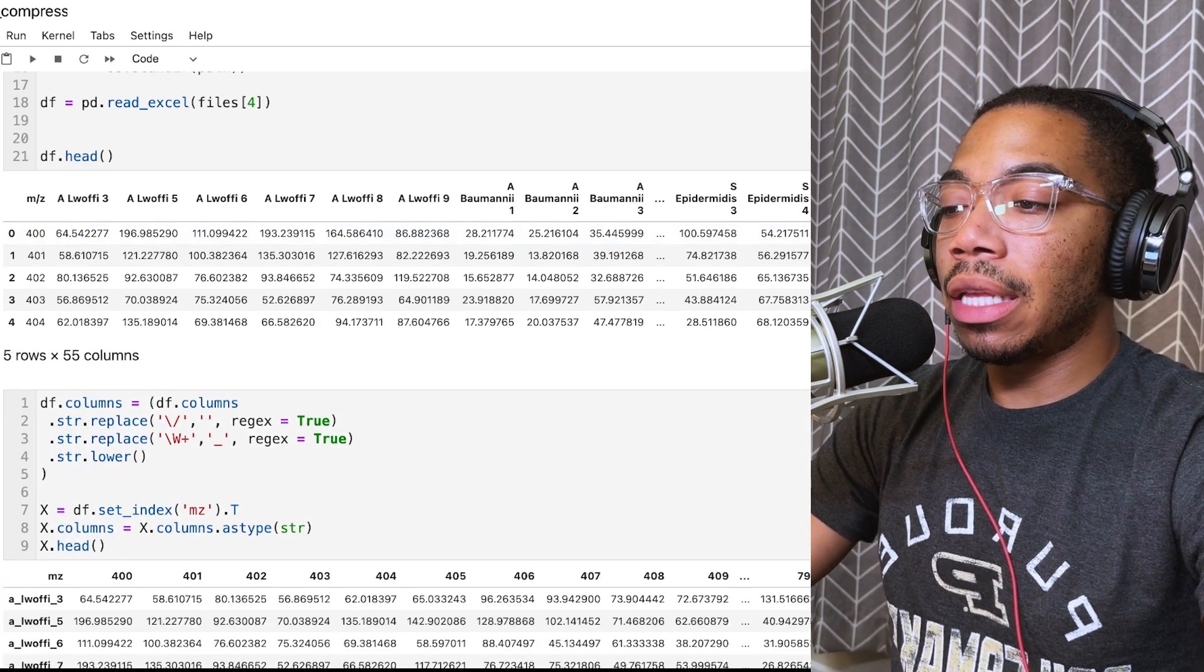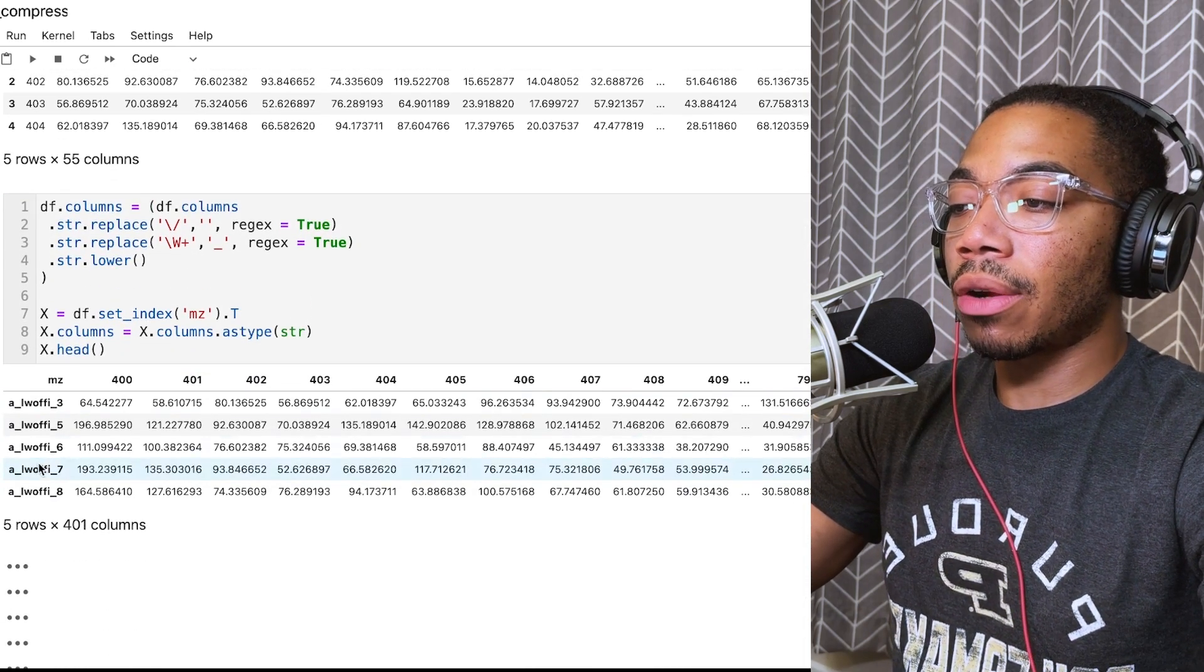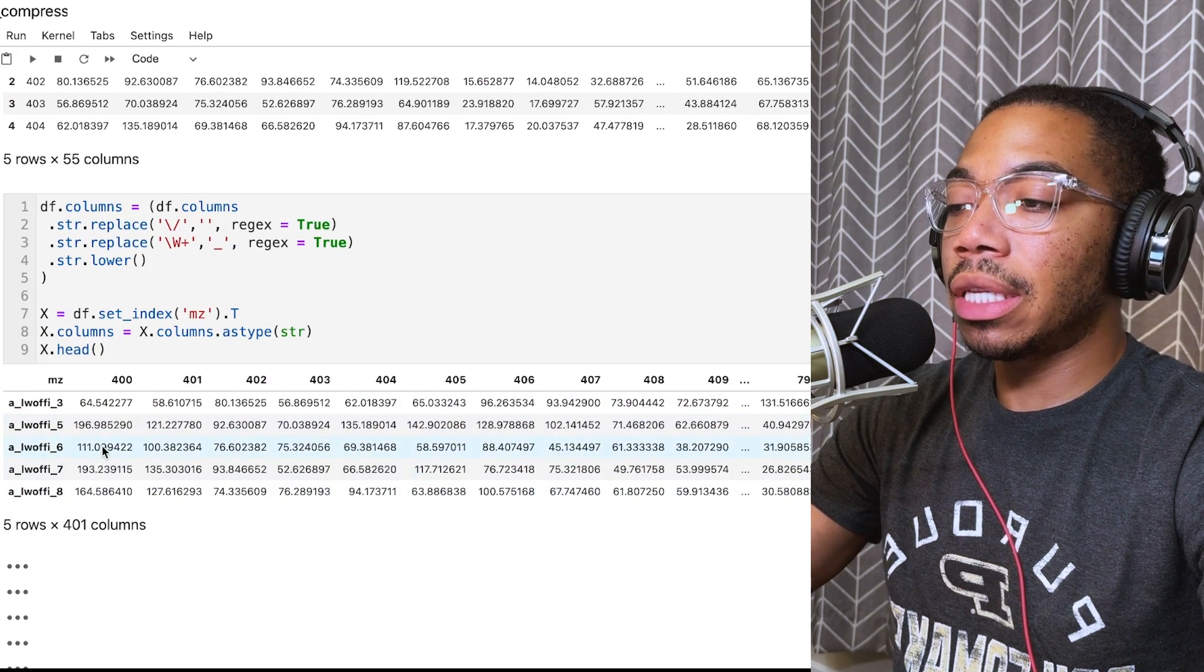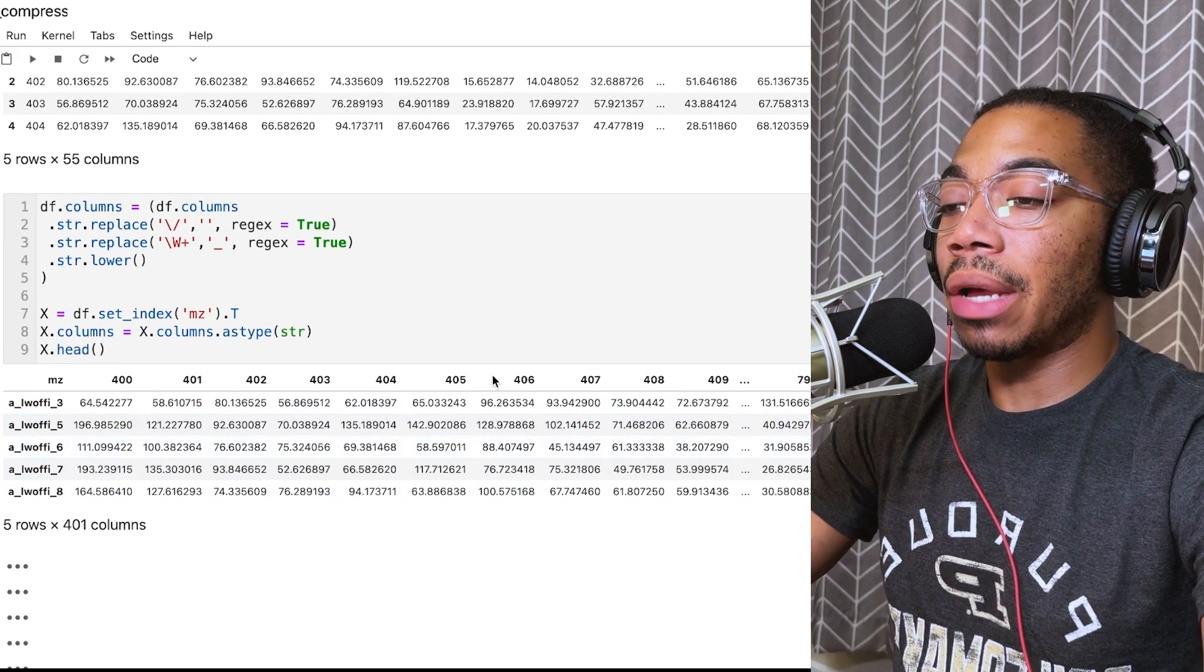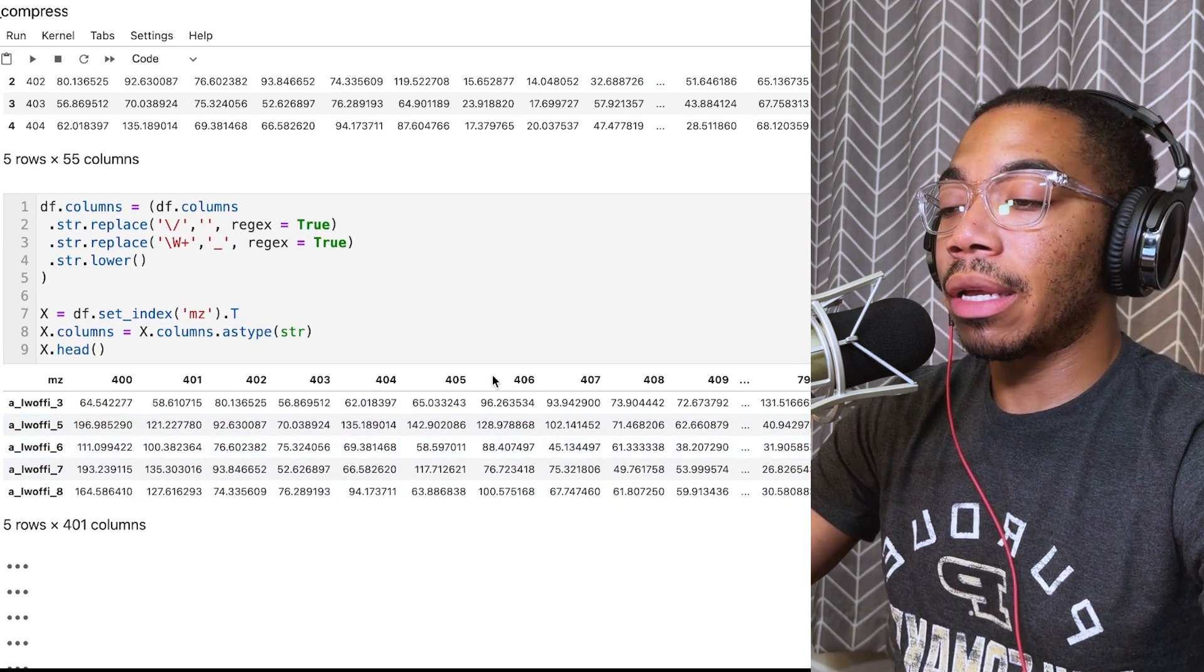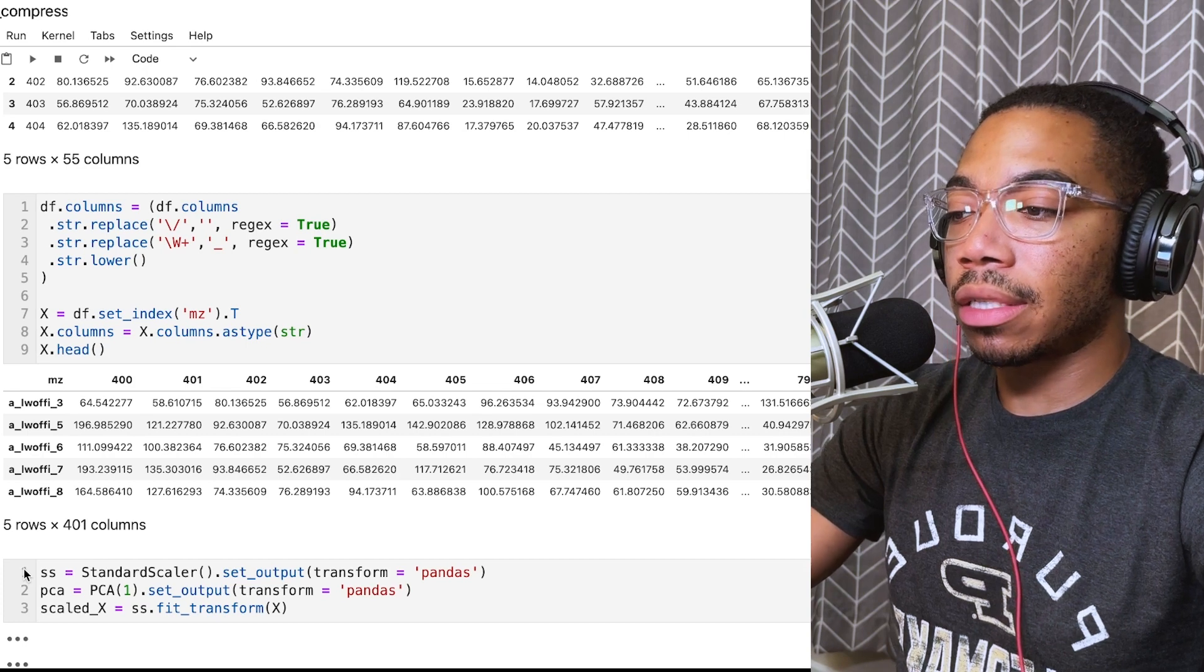In this cell, I am actually just cleaning the data, moving our samples to the index, and these M over Z are now stored in the column headers. This is a common format for data analysis.